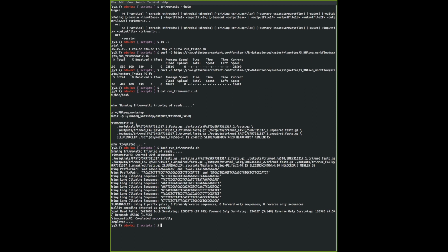Shouldn't take too long. I'll give you about three minutes-ish. I will do this together with you as well, but I also haven't got this script ready, so I'm going to do this on my own. You can try it on your own.